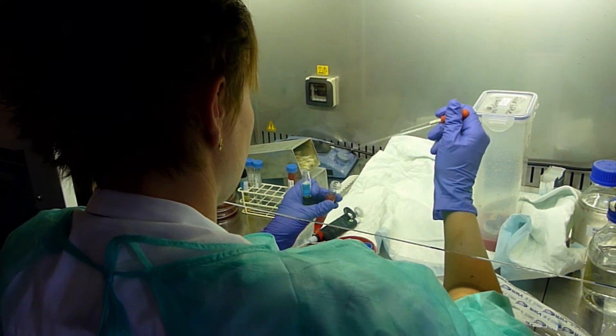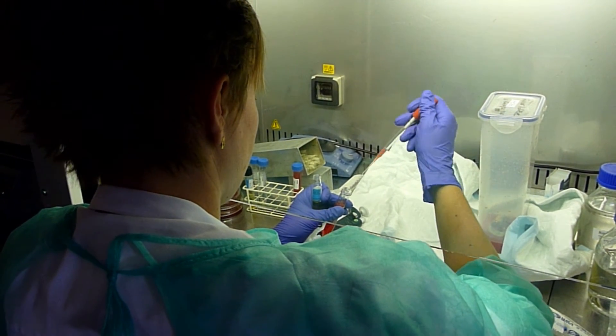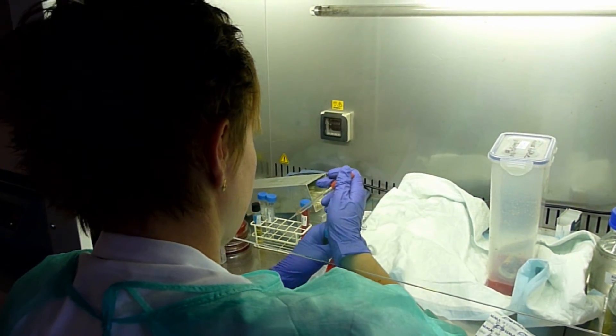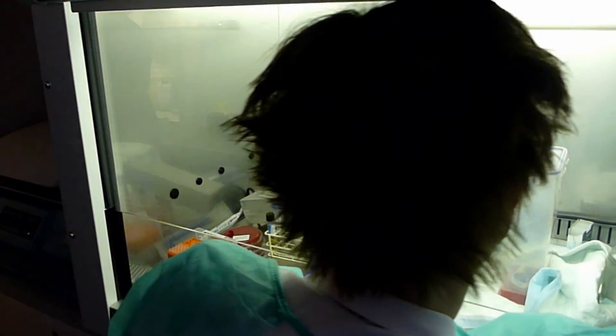And then you can see what's next. And then you set up your cup and mix it up.